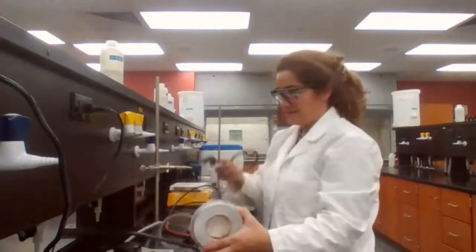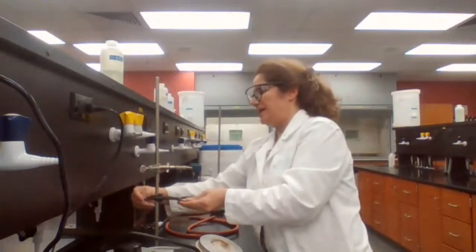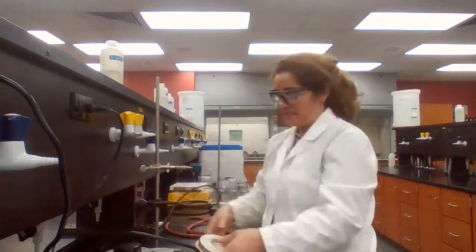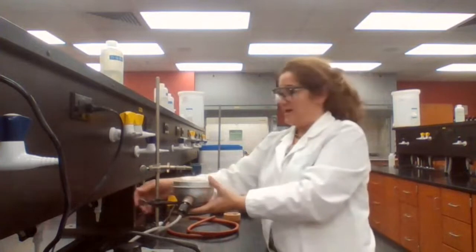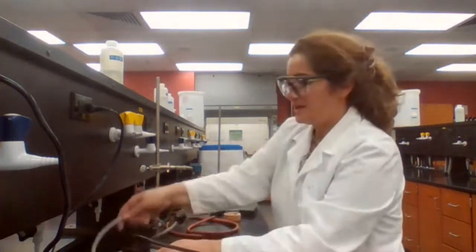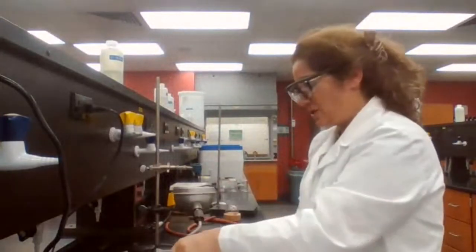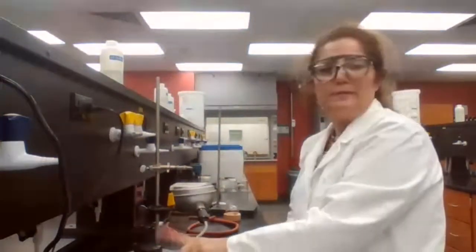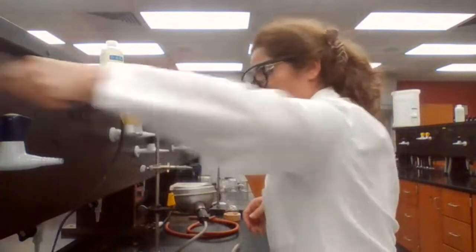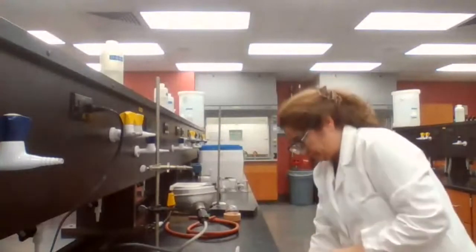I'm using a ring stand this time because we don't need the hot plate. I'm using a ring stand to support the heating mantle. It cannot stay on the bench top. It has to be elevated. So I'm using an iron ring to support the heating mantle. The heating mantle cannot be plugged directly into the wall, so we are using the power regulator for the power, and I'm going to plug in when everything else is ready.